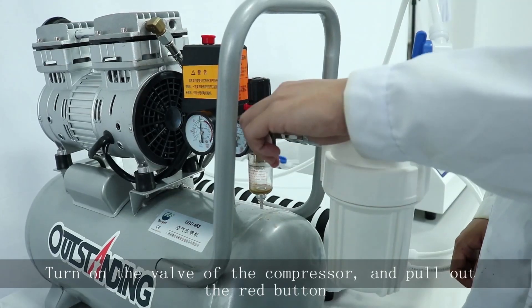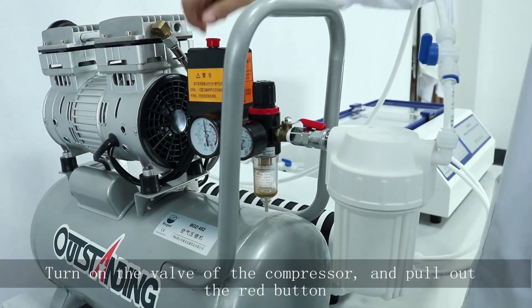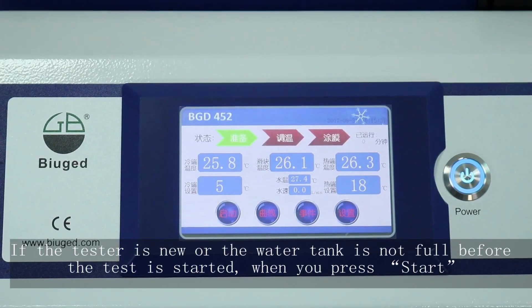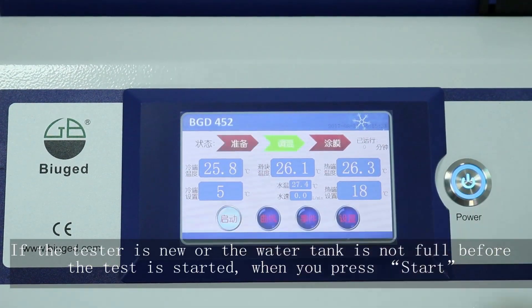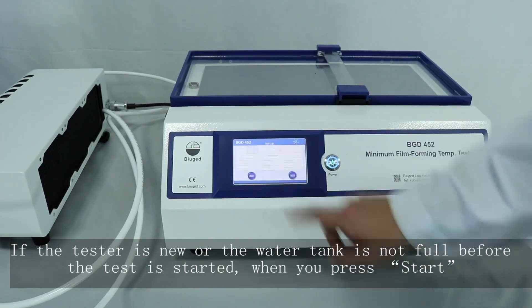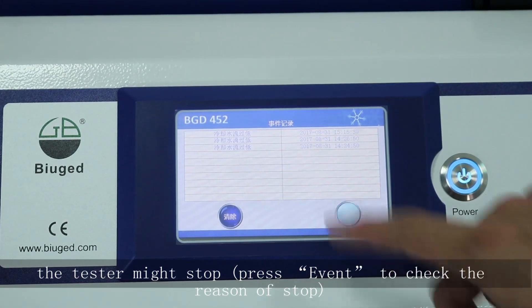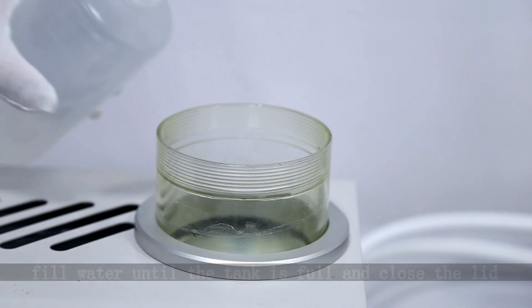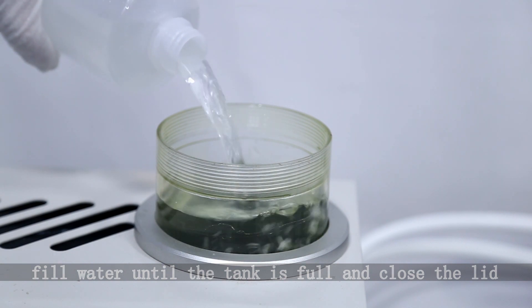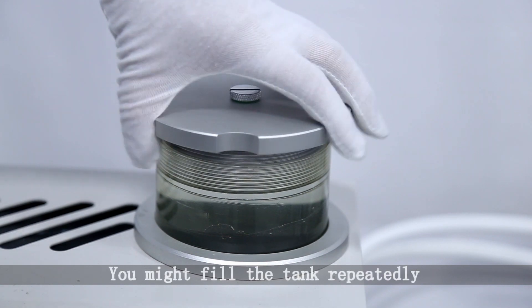Turn on the valve of the compressor and pull out the red button. If the tester is new or the water tank is not full before the test is started, when you press start the tester might stop. Press event to check the reason for the stop. Fill water until the tank is full and close the lid. You might need to fill the tank repeatedly.